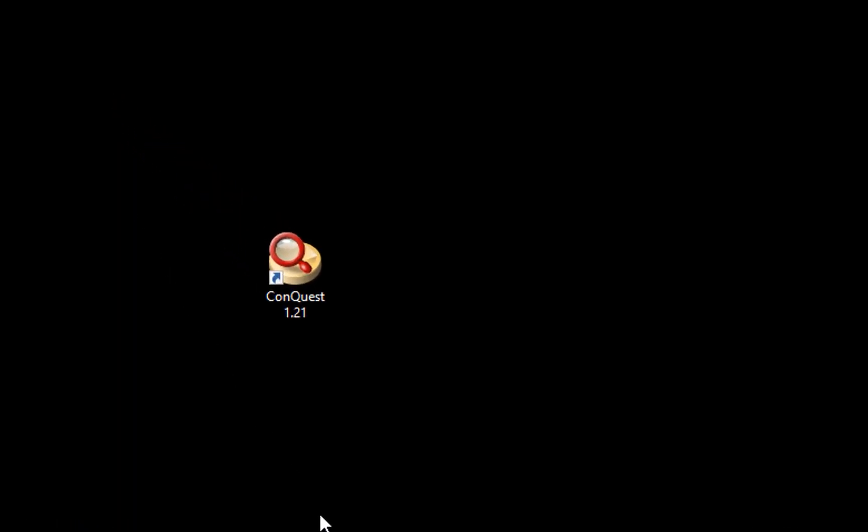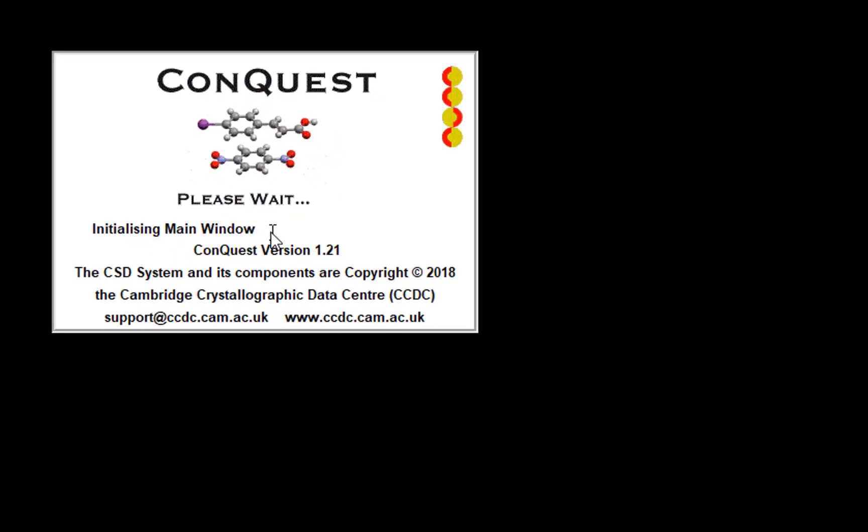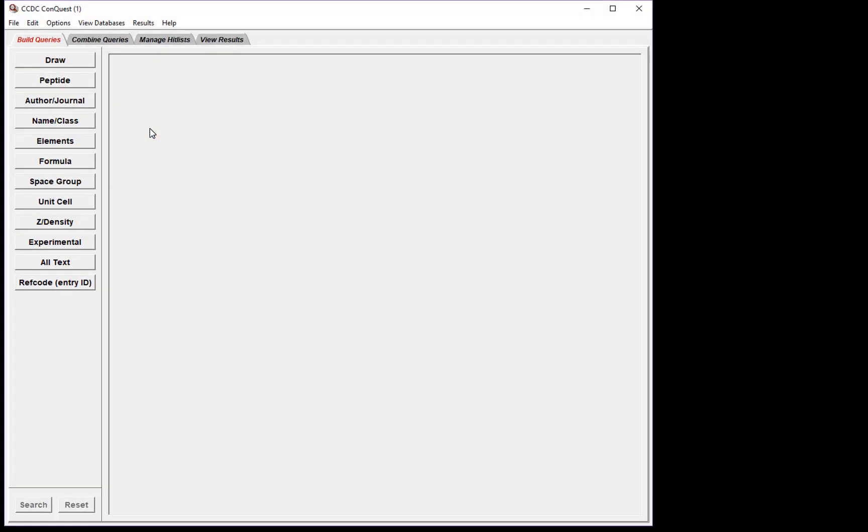To begin the search, launch Conquest. On Windows, I simply double-click the icon. The main Conquest window opens. Along the left-hand side, you can see all the various search types that you can perform. Across the top of the window, the tabs indicate the steps in the search process.